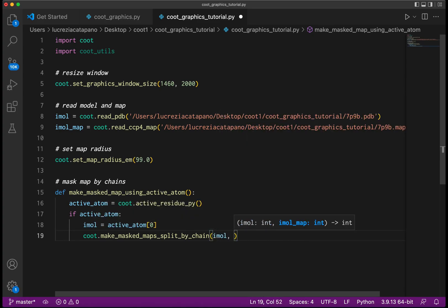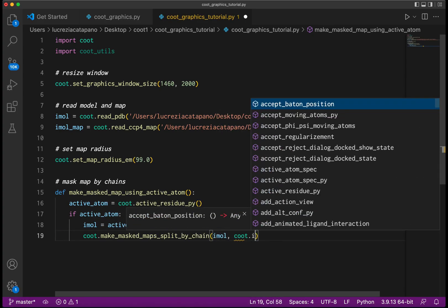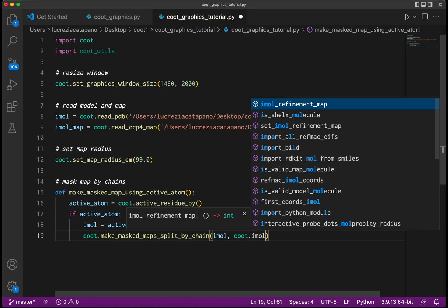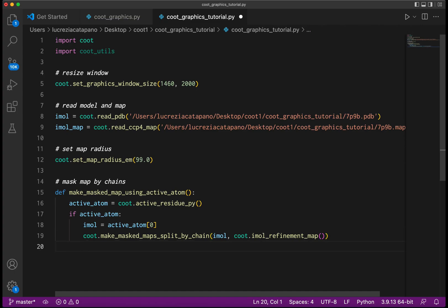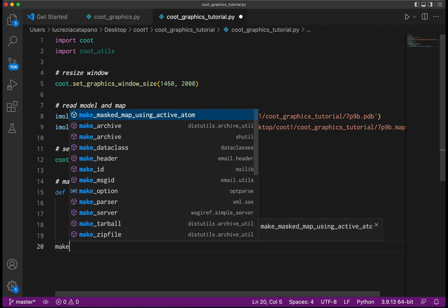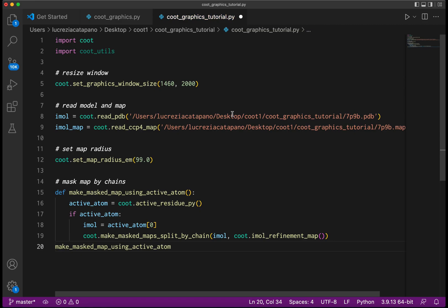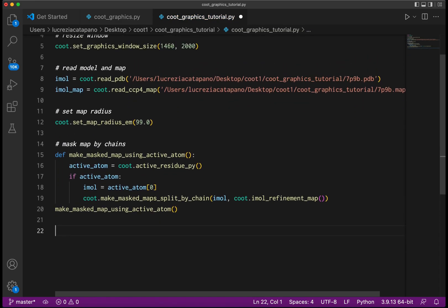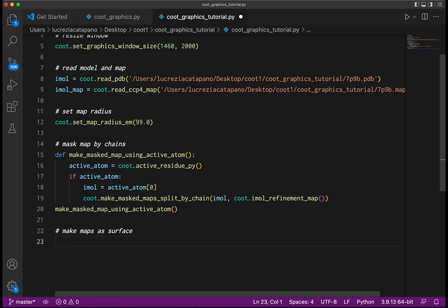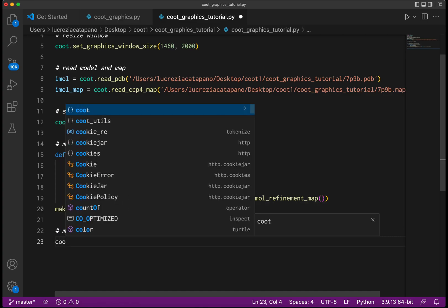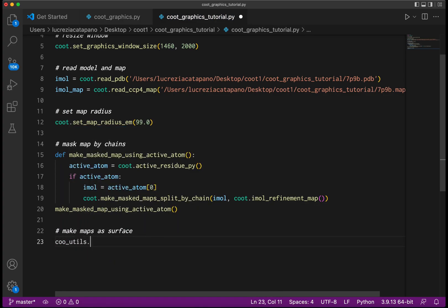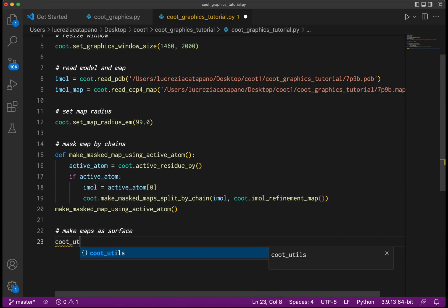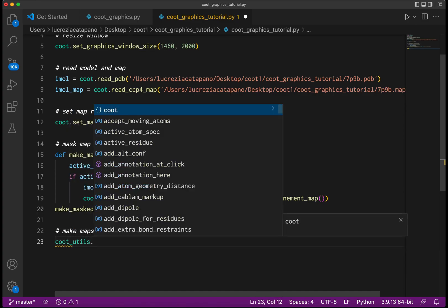The function imol_refinement_map will return imol_map. By default Coot will represent the new surface as a traditional chicken wire mesh. We don't want that - we want to make our maps as a surface. To do this we can use the solidify_maps function that will solidify all the maps for all the chains.